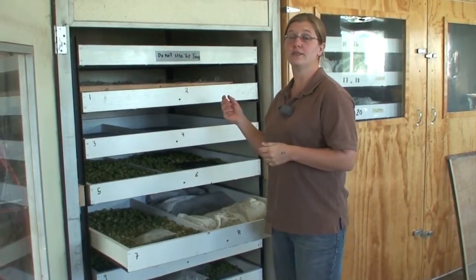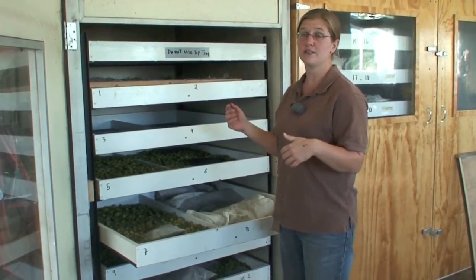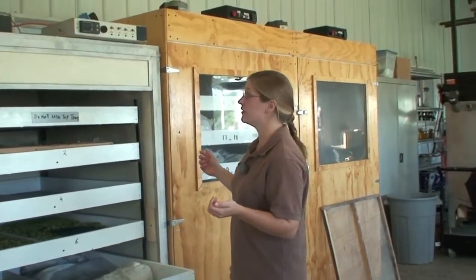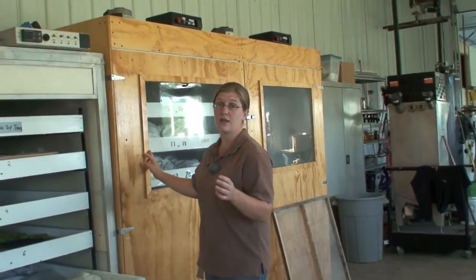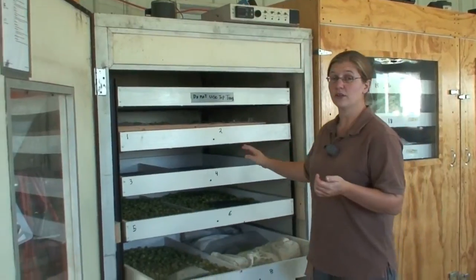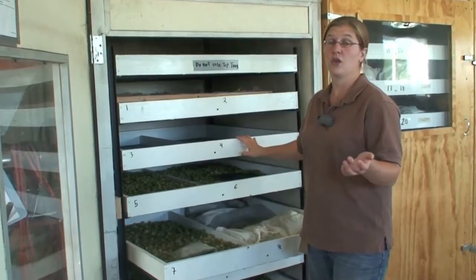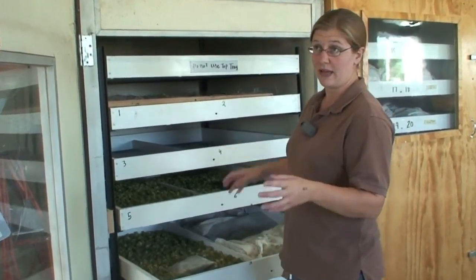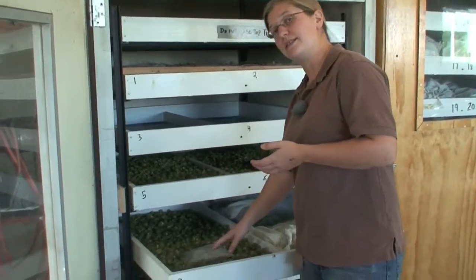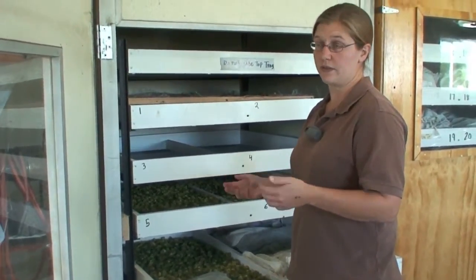There are multiple oasts that we use at UVM Extension. This one is actually a modified ostrich egg incubator — we used it last year and it worked so well that we designed another oast that mimics the setup. You can find the designs on our wiki page on our website. We number the trays in the oast because we usually harvest multiple plots or varieties at the same time. You want to put your subsample bag in the tray and bury it so that air can pass around it similarly to all of the other hops.